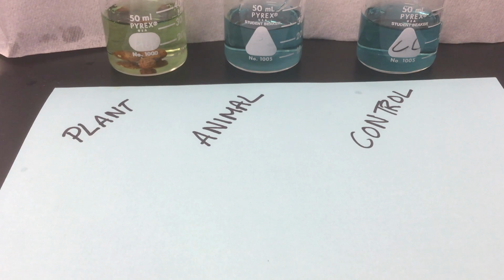All right, so we are back, and you can see in our first beaker, which is labeled plant, it's got our beans in it, that there's definitely a different color today than yesterday. And just to point that out, I did put some white paper behind it, just a piece of scrap paper towel, to make that color change easier to see, that color difference.